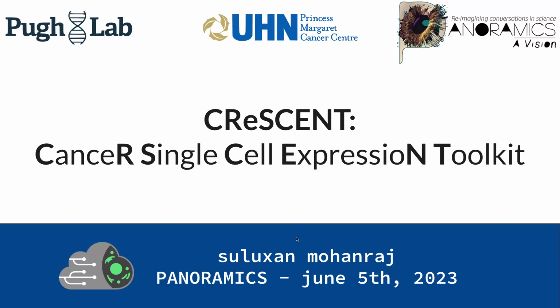Usually with single-cell analyses, we have the need of high-performance compute. Certain labs that are generating this data might not have access to that compute. There's also the fact that single-cell analyses require complex workflows and expertise to tailor those workflows, and usually happens in programming languages like Python and R, where biologists might not be familiar, or might be familiar but a little bit intimidated.